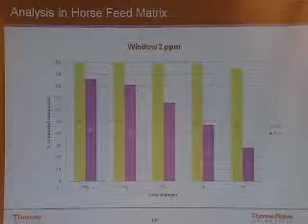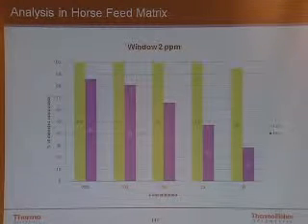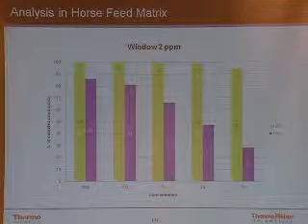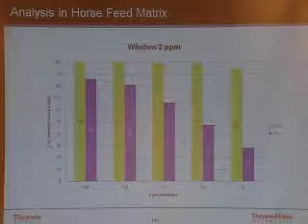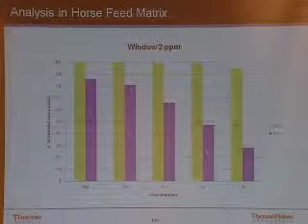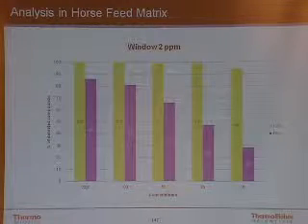And what they did was they did a study where they took 151 pesticides, mycotoxins, and veterinary drugs. They just mixed them all up in this straw, in this horse feed. Okay? And then they set out to see how many of the 151 compounds could you identify using exact mass spectrometry, accurate mass.